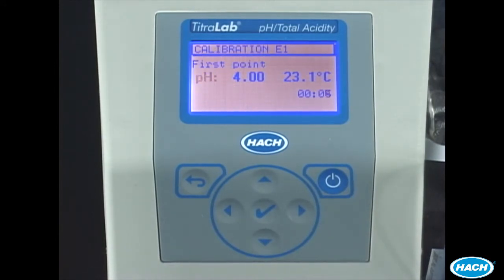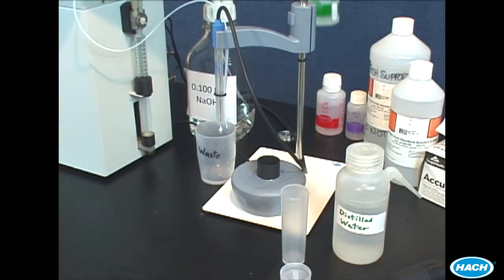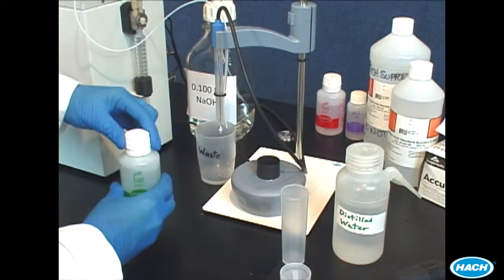Following successful acceptance of the first calibration, begin preparing the second buffer. Prepare the pH 7 buffer the same way you prepared the pH 4 buffer.